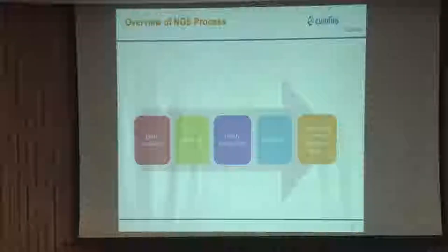So for that, we do a library QC, and we know that a paired end library should be somewhere around 300 to 400 base pairs. This should be my library size, having an adapter of 120 bases. So we subtract it, and we should have a DNA template somewhere around 250 to 350, wherein I have a very small insert size in it, right?